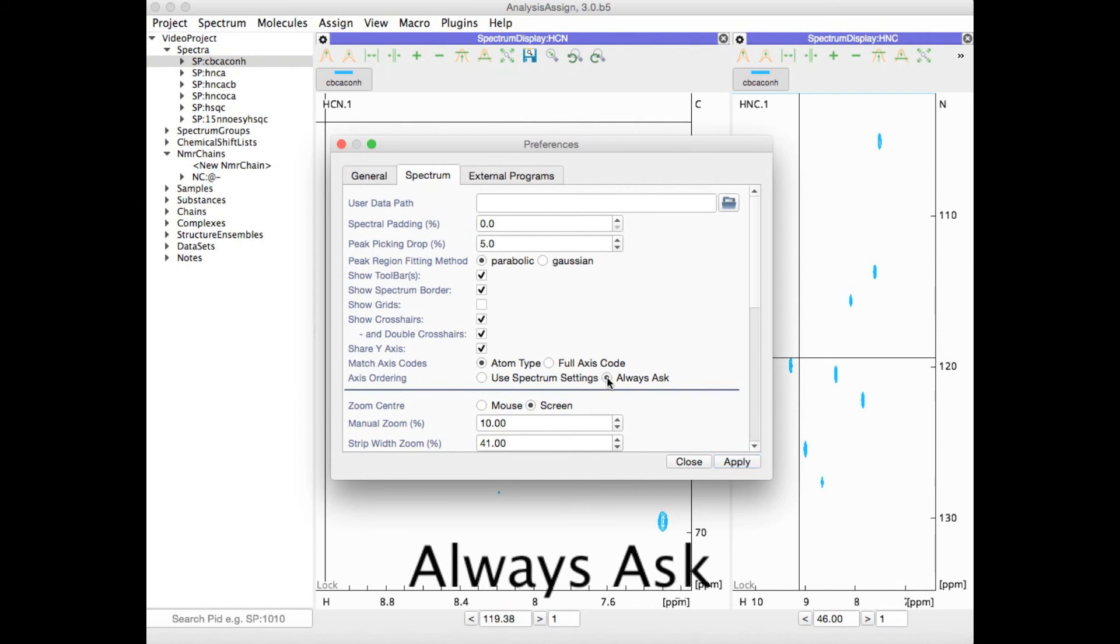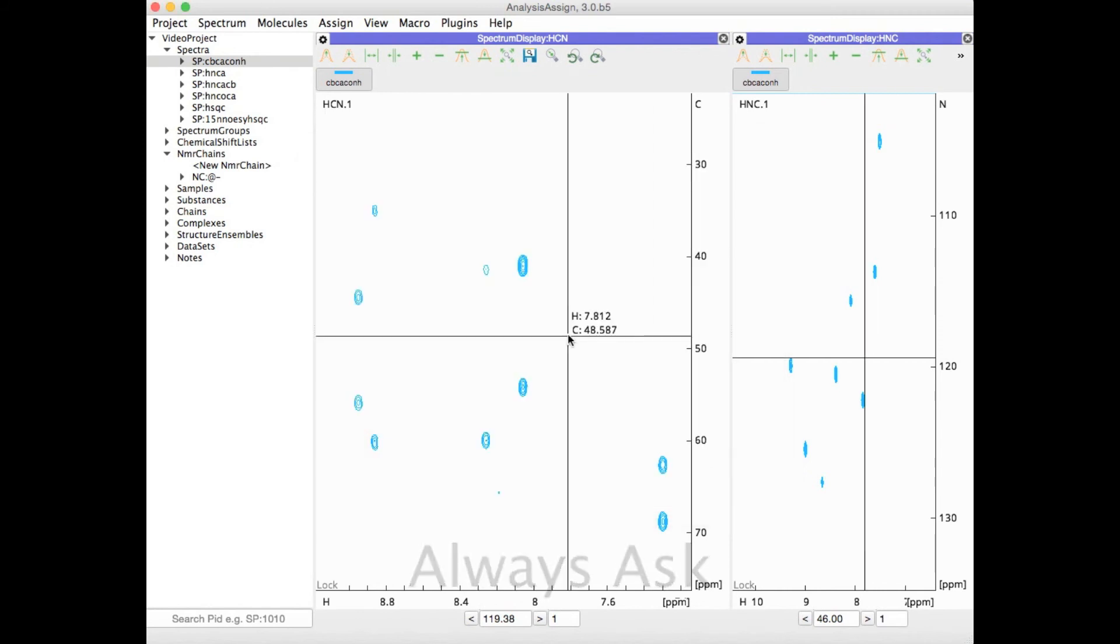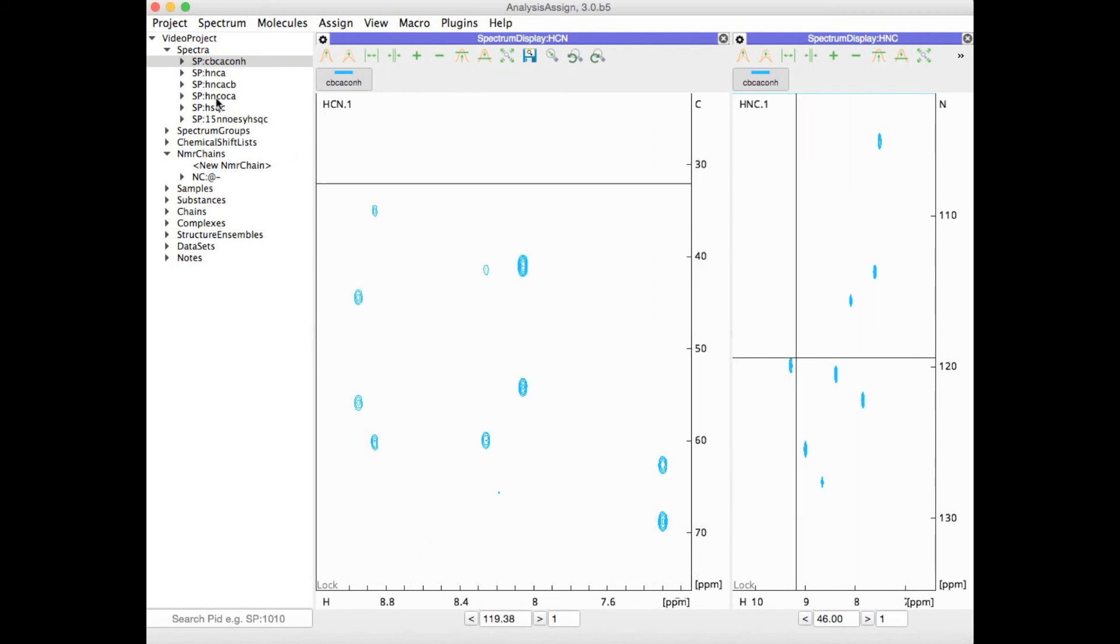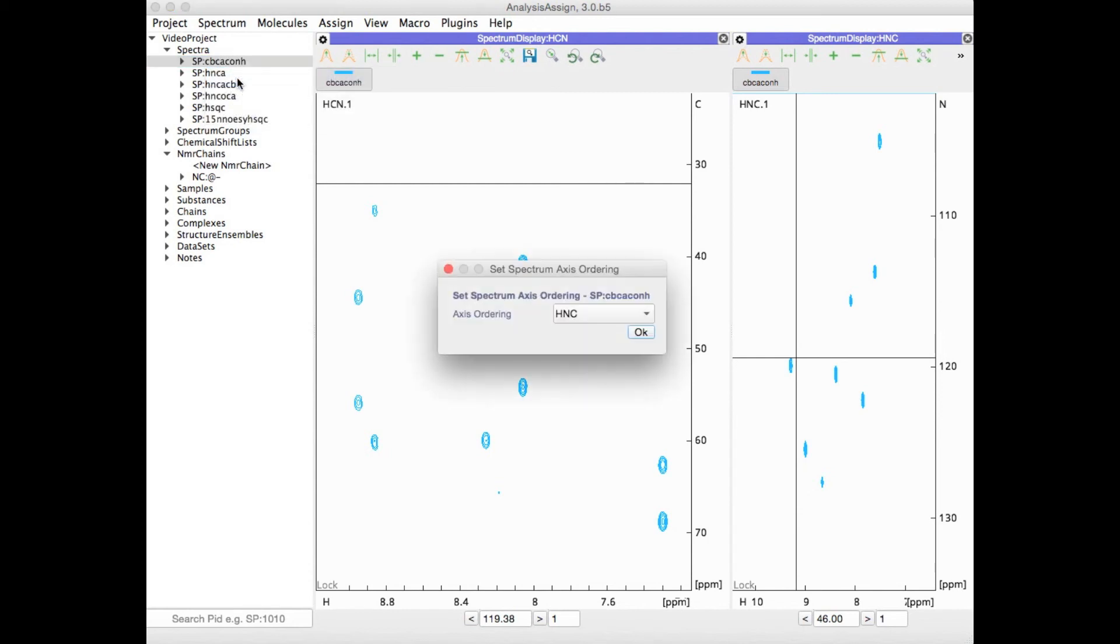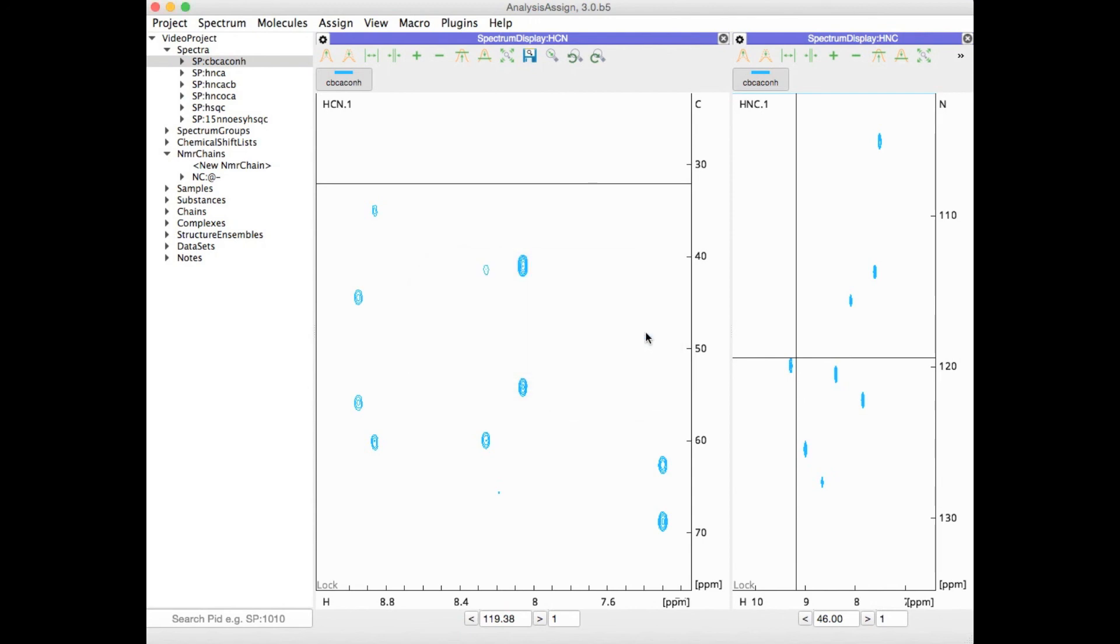choose the option Always Ask. In this case, every time I open a new module, I'll be asked what arrangement I'd like to open it in.